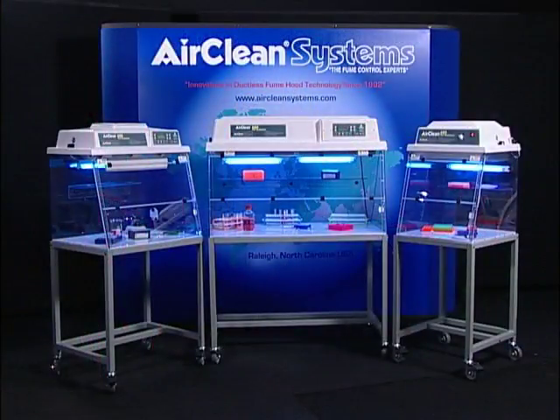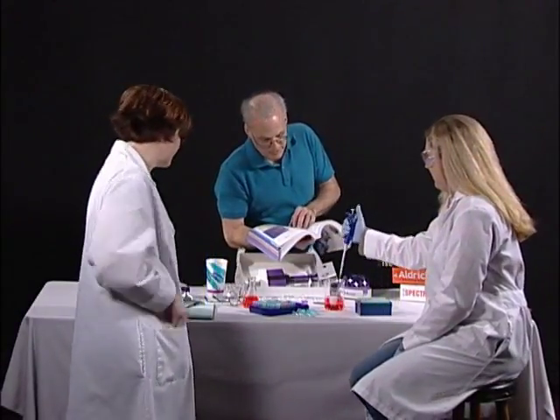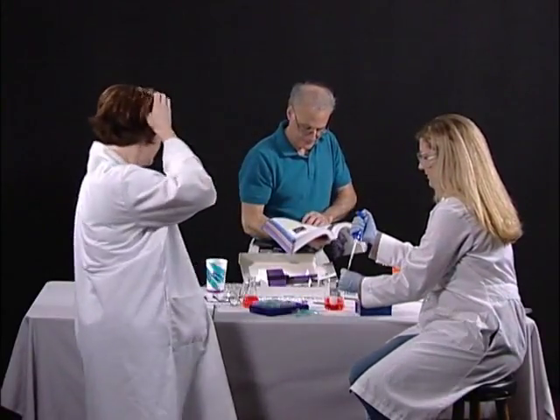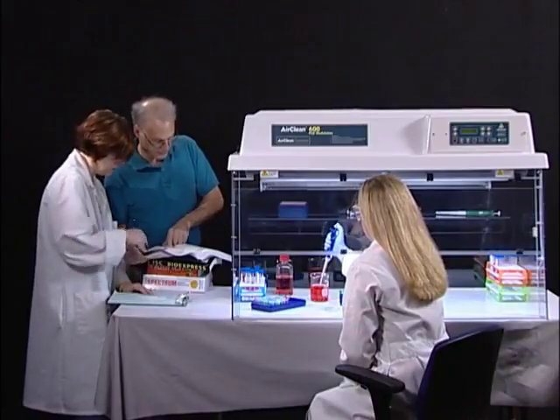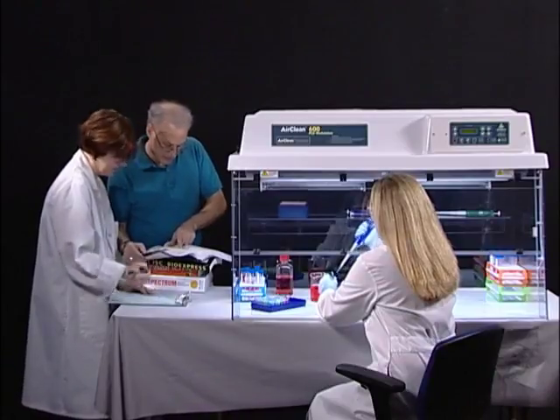AirClean Systems PCR workstations are designed as application solutions for the manipulation and amplification of DNA and RNA. Cross-contamination during amplification can lead to inaccurate results, costing the lab technician valuable time and consuming expensive reagents. AirClean Systems PCR workstations offer a controlled environment, improving your odds and reducing the amount of reagents required to achieve your desired result.